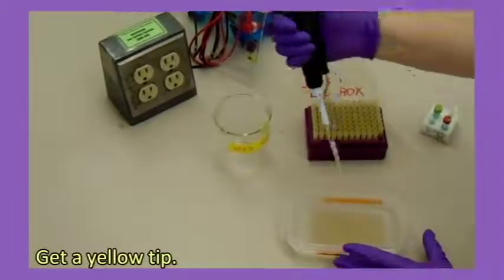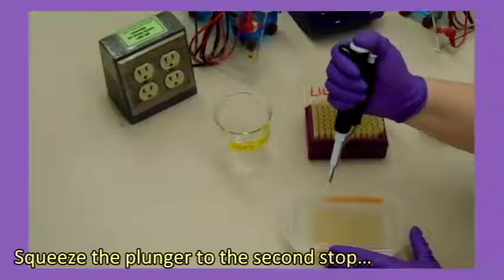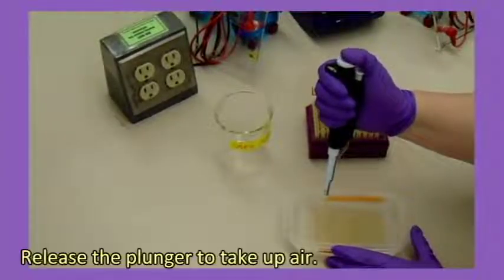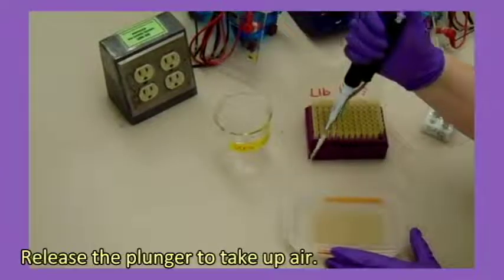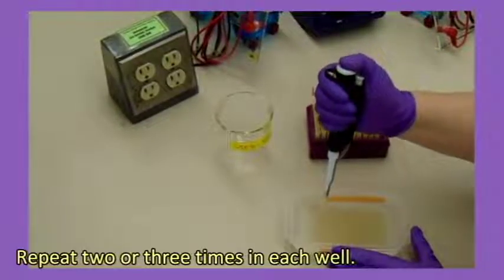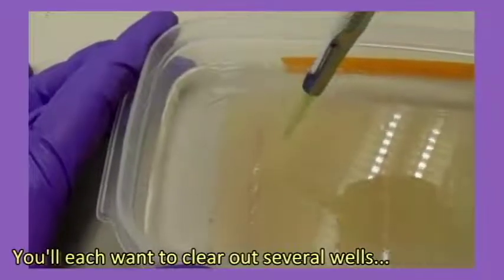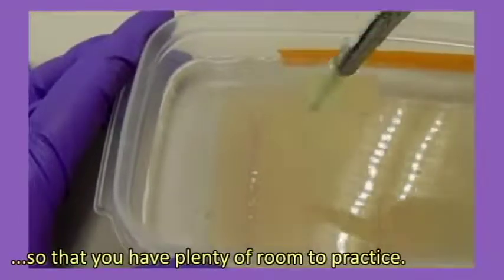Get a yellow tip. Squeeze the plunger to the second stop and put it into a well with a bubble. Release the plunger to take up air. Repeat two or three times in each well. You'll each want to clear out several wells so that you have plenty of room to practice.